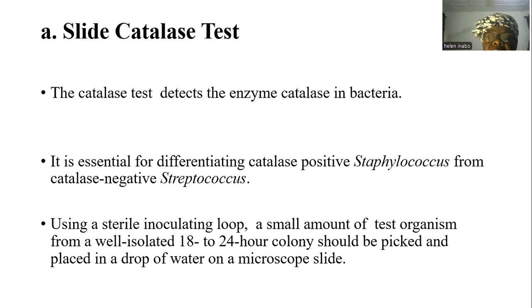The bubbling and frothing that is seen in the positive test reaction is due to the escape of oxygen that is produced.